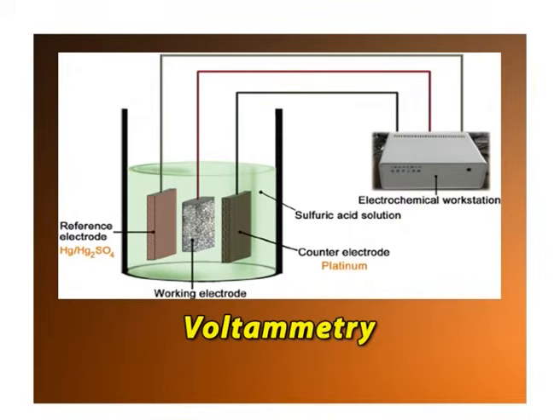Now, after this, another technique is voltammetry. Voltammetry is another important electro-analytical technique which is widely used in various analytical laboratories and various industrial processes.